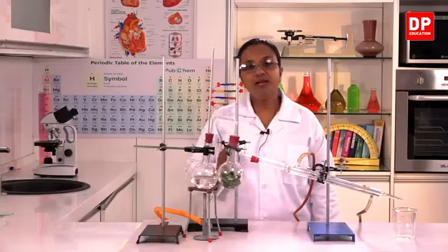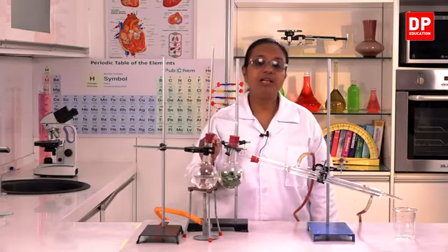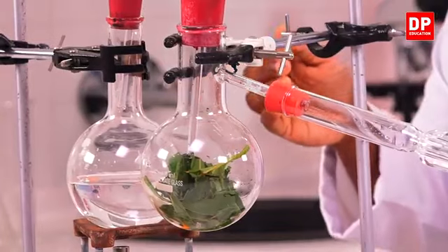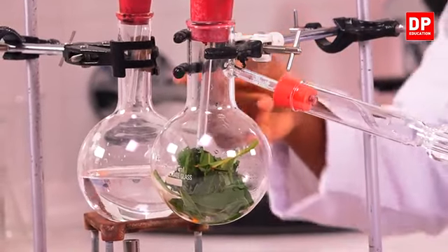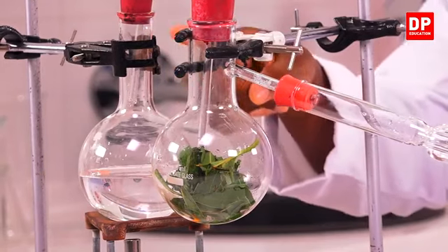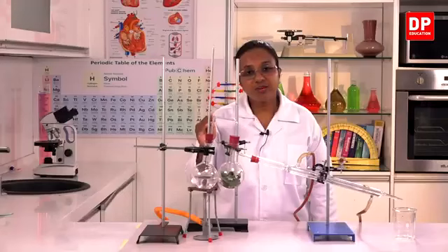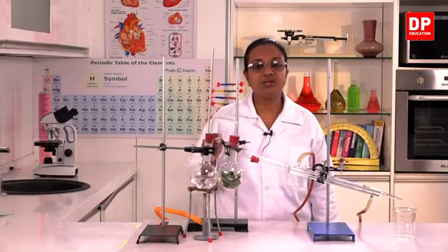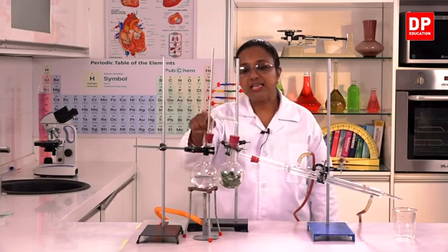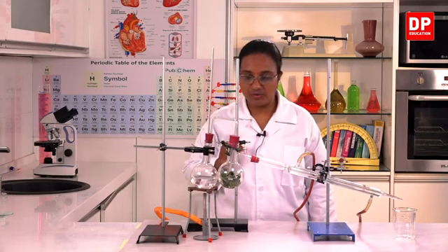So when we light the burner, due to the heat, steam will be produced. When water reaches the boiling point, it will start boiling and generate steam. And you can see here there is a glass tube. So the water vapor will enter the glass tube and travel into the second flask. At the same time, we can monitor the temperature reading using the thermometer.